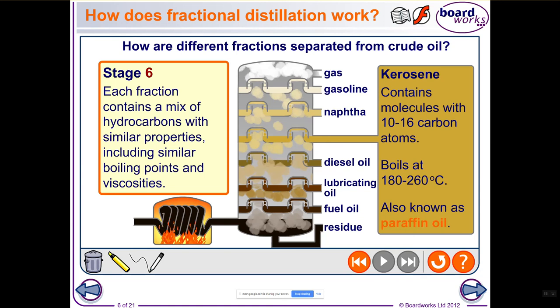Kerosene. So what color is it? Most of these are mostly transparent, but they can be slightly yellowy tinted. As you can see from the colors here, Aidan, the further down we go in this column, the darker the colors get. So they go from kind of clear to yellowy, and then eventually brown, and then eventually black.